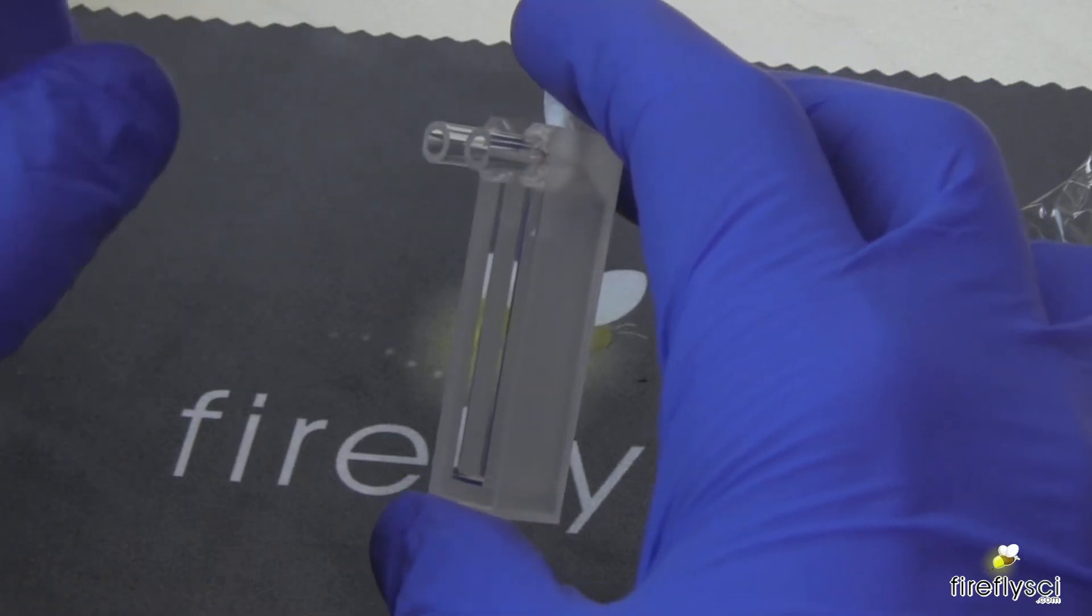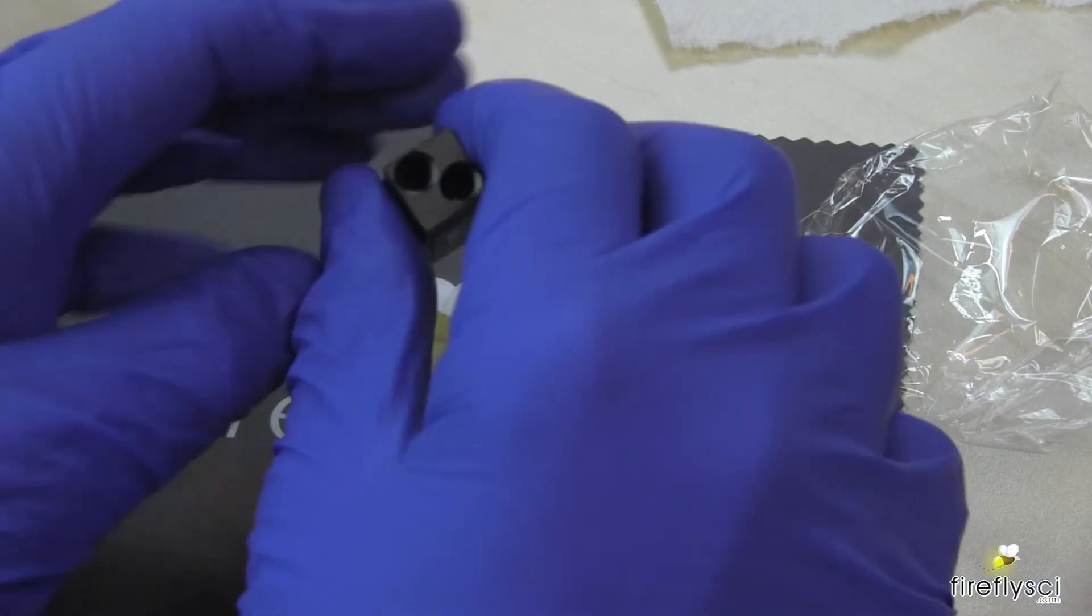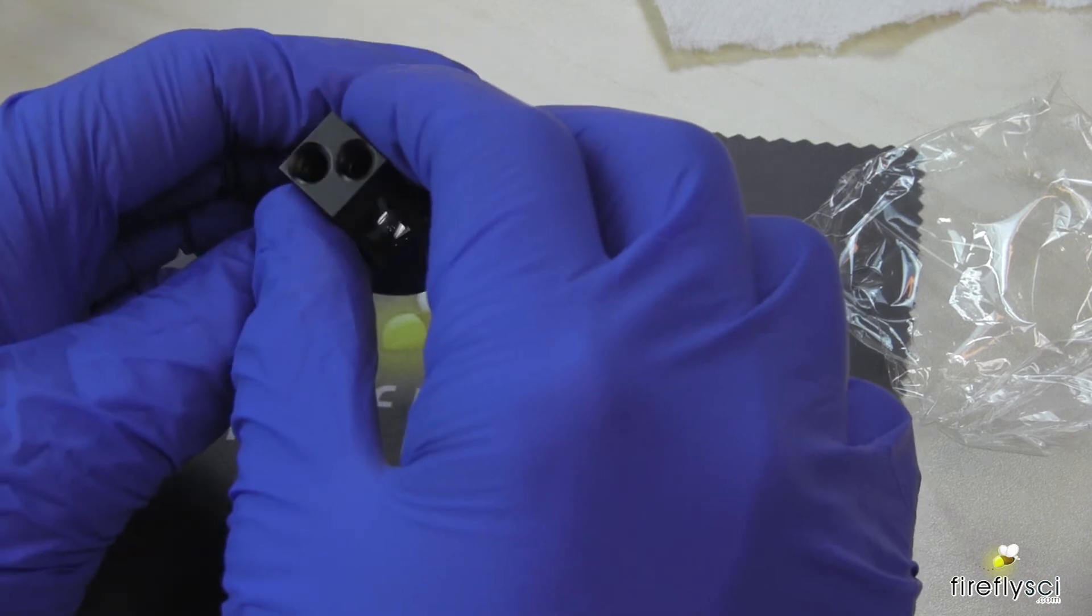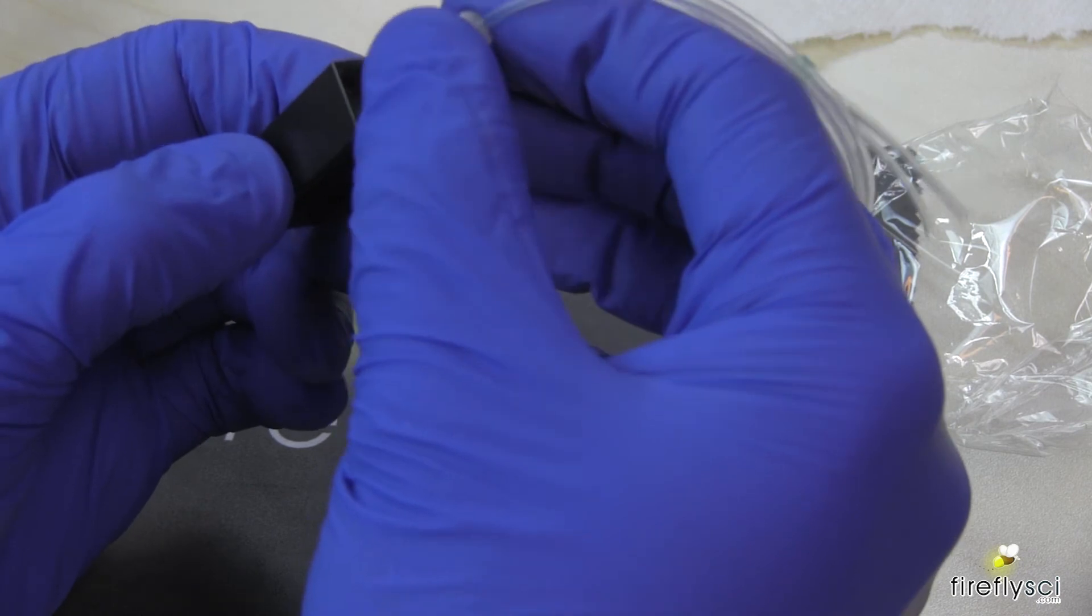Some have the inlet and outlet tubes on the face of the cuvette. This flow cell we see here has detachable inlet and outlet tubes, or in this case it's M6 connectors, which screw into these ports right here.